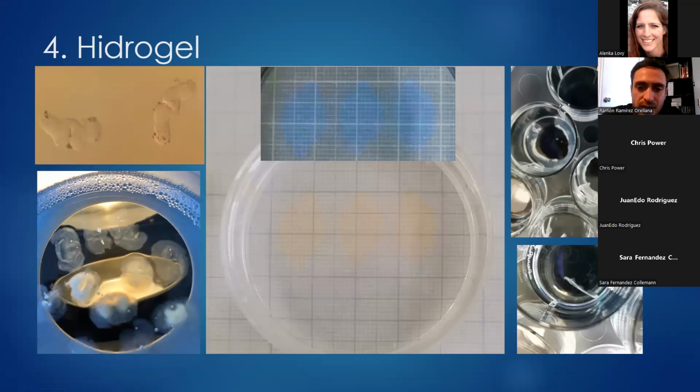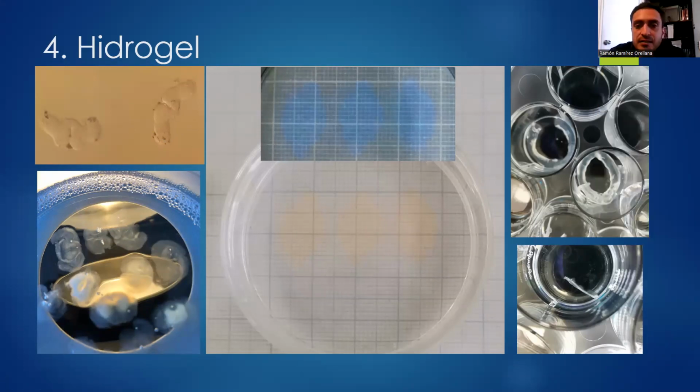que el único detalle que podría comentar es que quedan un poco de un color amarillo, ¿ya? En el caso del cerebro, con esta técnica, no sé si alguien tiene alguna experiencia con esto, pero quedan un poco amarillos, pero sí transparentes. En el caso de intestino, funciona súper bien y los deja completamente transparentes, al igual que con los nervios, nervio ciático y nervio óptico, que también hemos hecho con esta técnica.